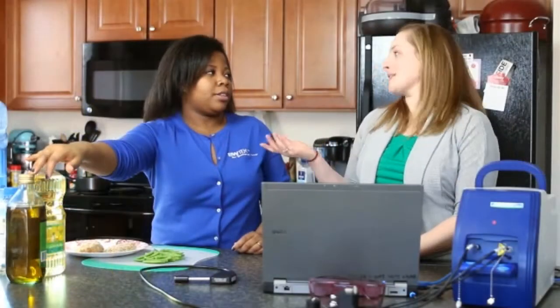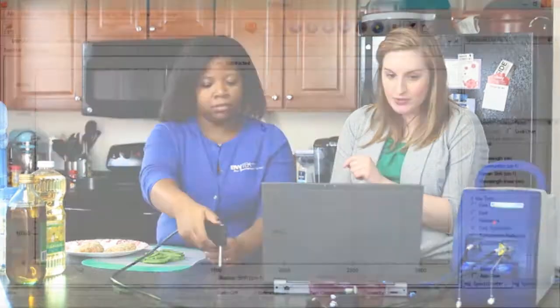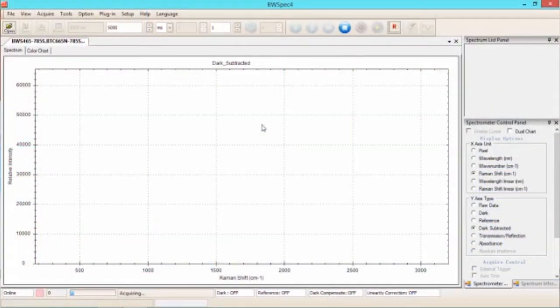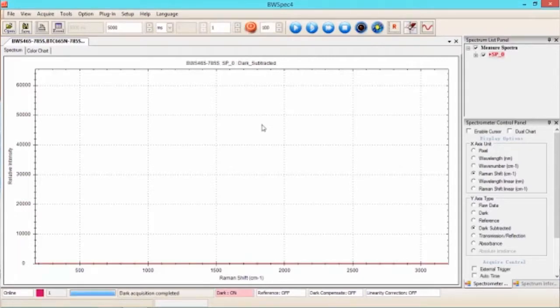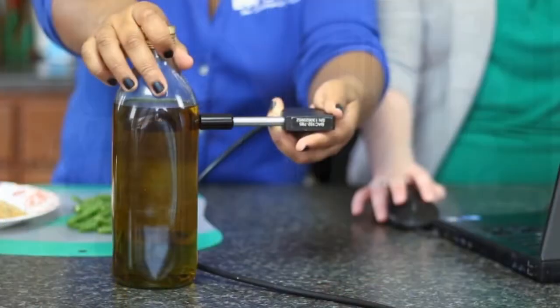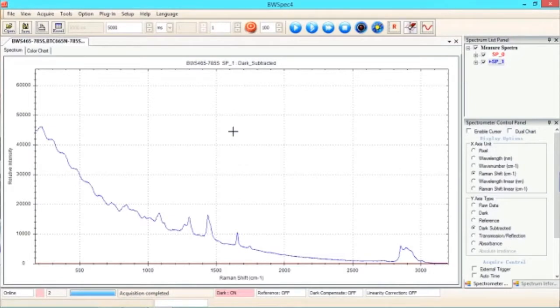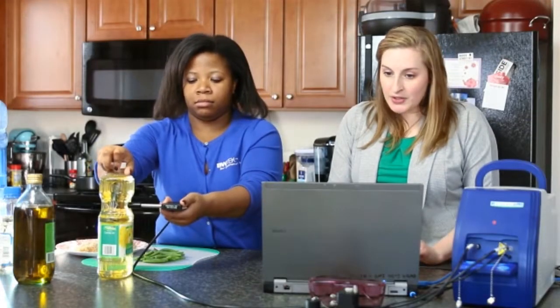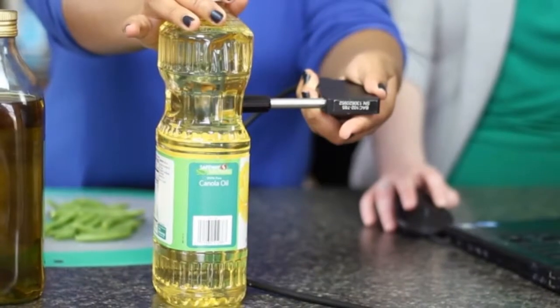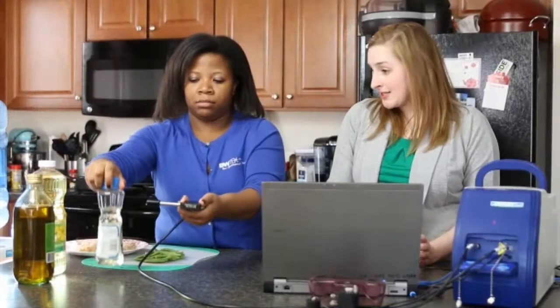Let's go ahead and take a couple of scans of the different oils we have here. We'll take a dark scan first — make sure the shutter is closed — and go into BWSpec to take the dark scan. Then we can grab the olive oil and take a scan of that as well. We'll take scans of the other oils too, and we don't need to take dark scans in between because the integration time is the same. It also works out that Raman can measure through the plastic or glass bottles, making it really easy.